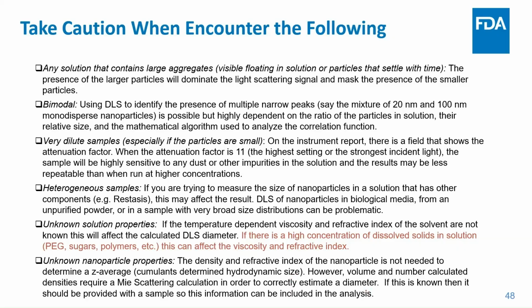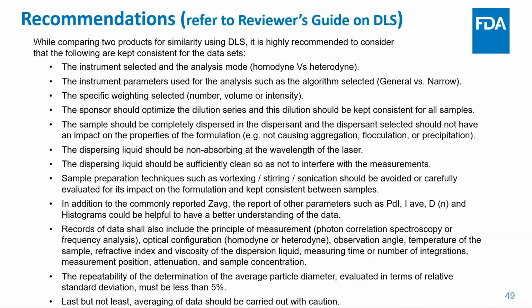And so the last, these things are all for you guys to go through: recommendations for reviewers. Just things that we all talked about here. When you're looking at somebody's application package, what wavelength are they using?